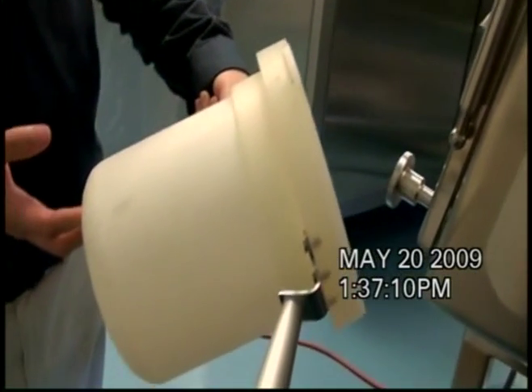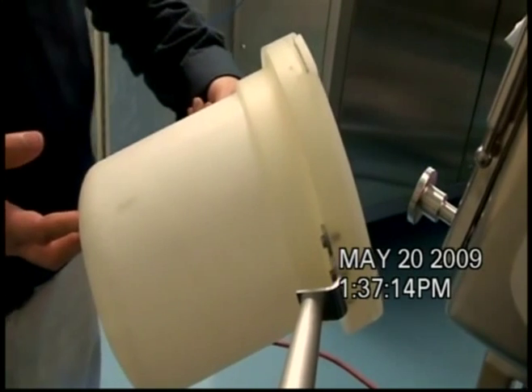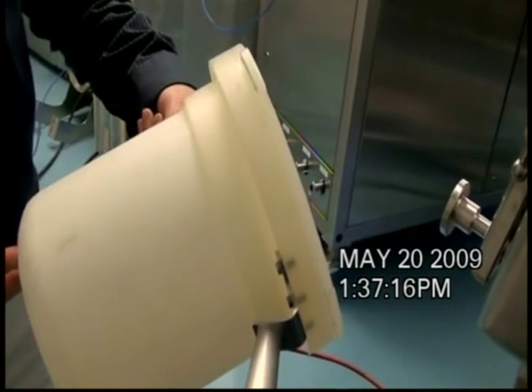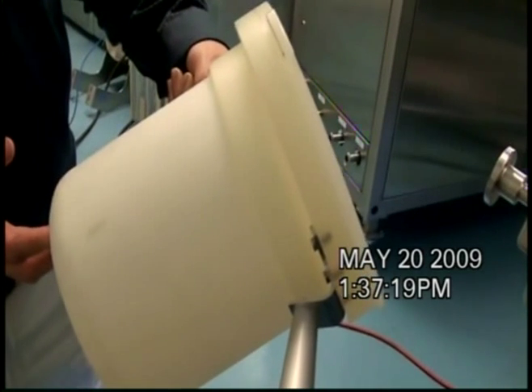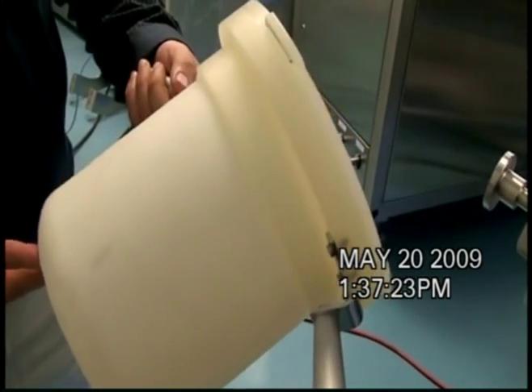This particular flange is mounted to a container. The diameters of the RTP system are 105mm, 190mm, 270mm, and 350mm. Container lengths come in 200mm on up to 600mm.